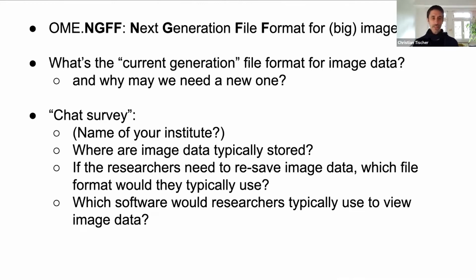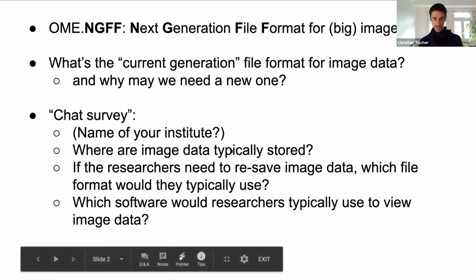Then if researchers at your institute need to resave data in some other format than what they get from the microscope, what would they typically use? For us, I think it's clearly TIFF. And then the third question is, which software would researchers typically use to view image data? And again, in my case, I think the answer is relatively clearly Fiji.